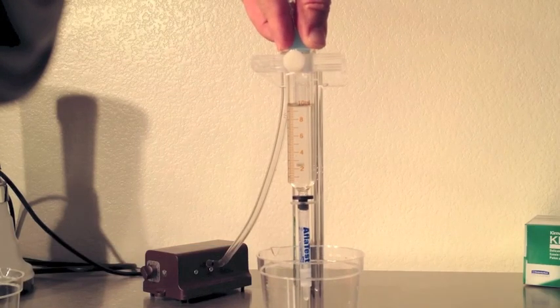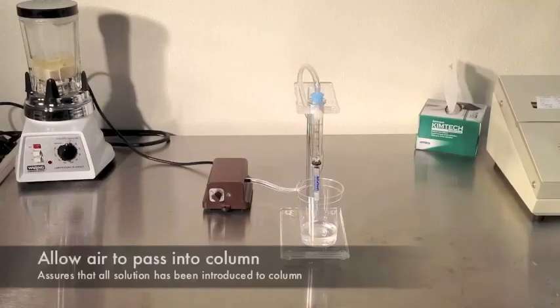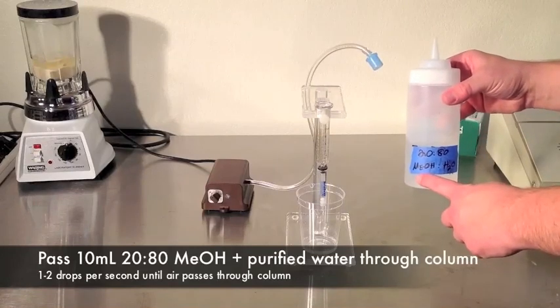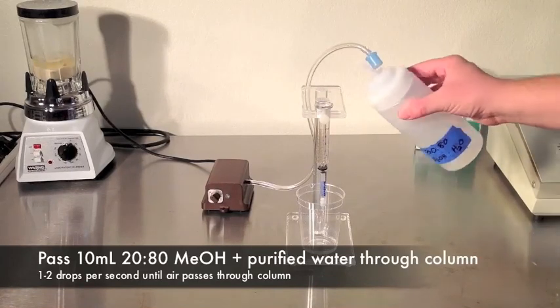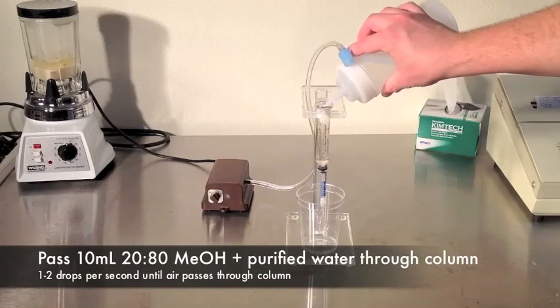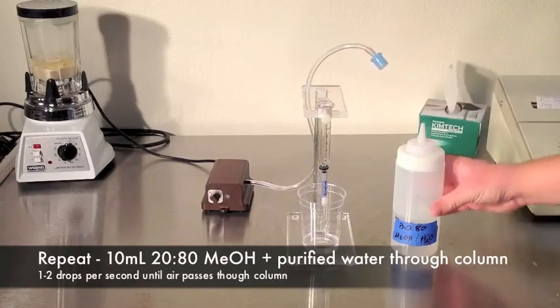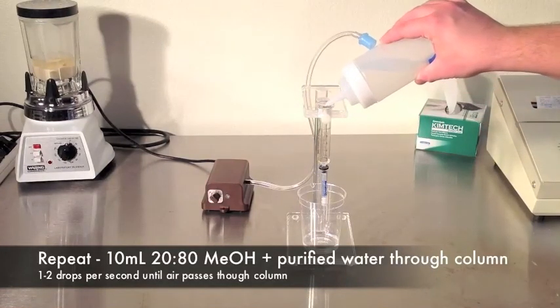This will take a little practice. When the sample is done dripping, allow air to flow through the column. Measure 10 milliliters of 20-80 methanol to purified water to wash the column. Pass one to two drops per second through the column. Once air has passed through the column, repeat the last step. Add 10 more milliliters of 20-80 and repeat.